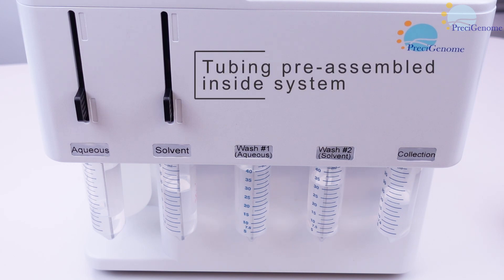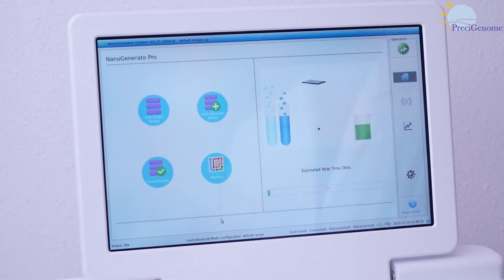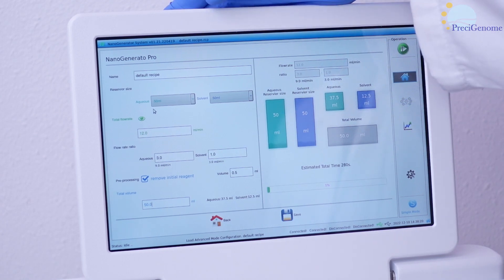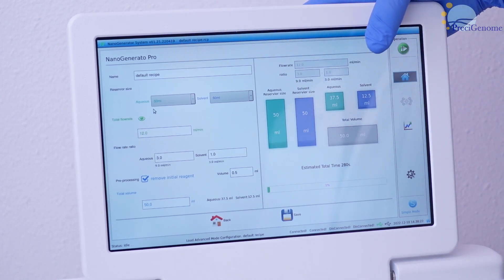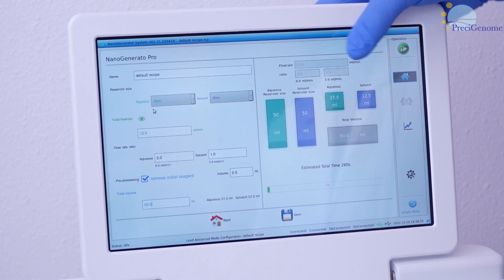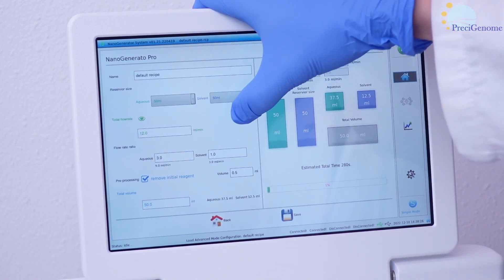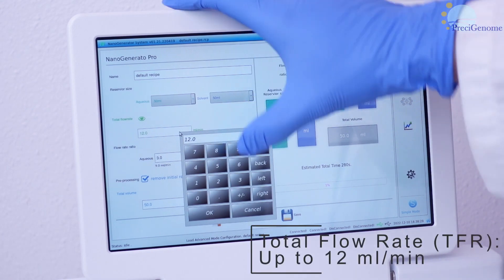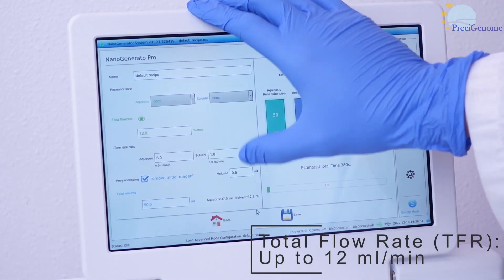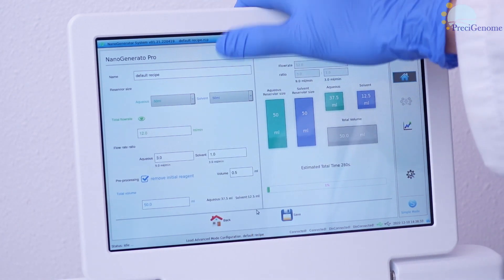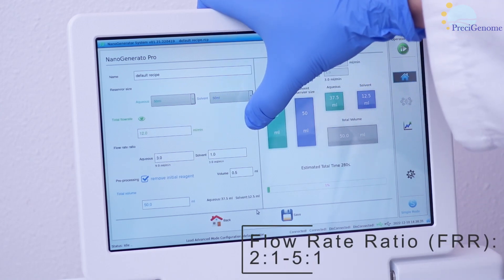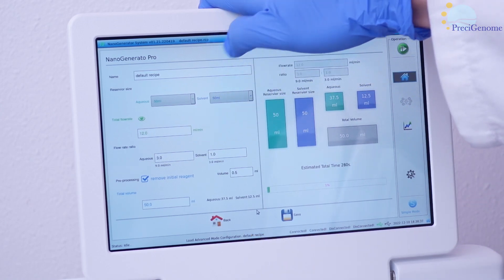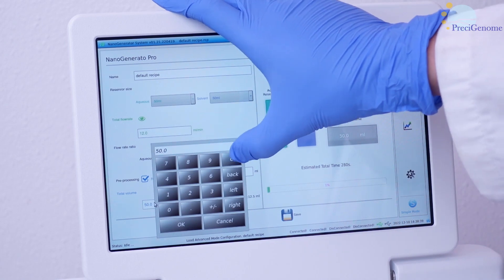From here, power on the Pro to access its software. From the home page, enter a new simple recipe. Here you will find several parameters which can be tuned to suit your applications. The reservoir size may be set here, while total flow rate may be set up to 12 milliliters per minute. The flow rate ratio may be set from 2:1 to 5:1, while total volume is dependent on the previously set parameters.